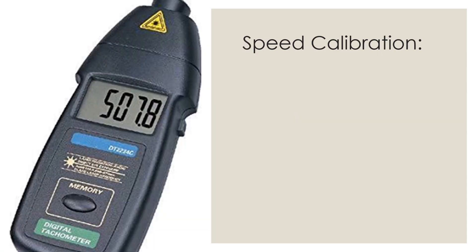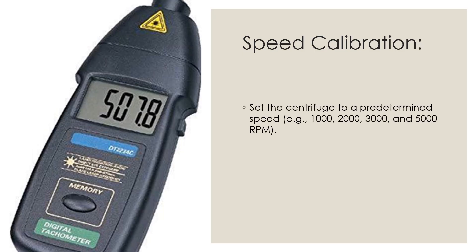Now we will discuss speed calibration. First, set the centrifuge to a predetermined speed — for example 1000, 2000, 3000, or 5000 RPM. You can set the RPM as per the operating range of the different types of centrifuge.